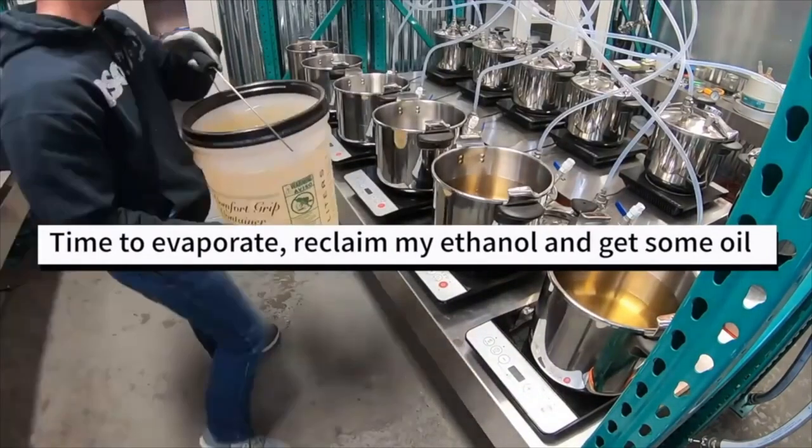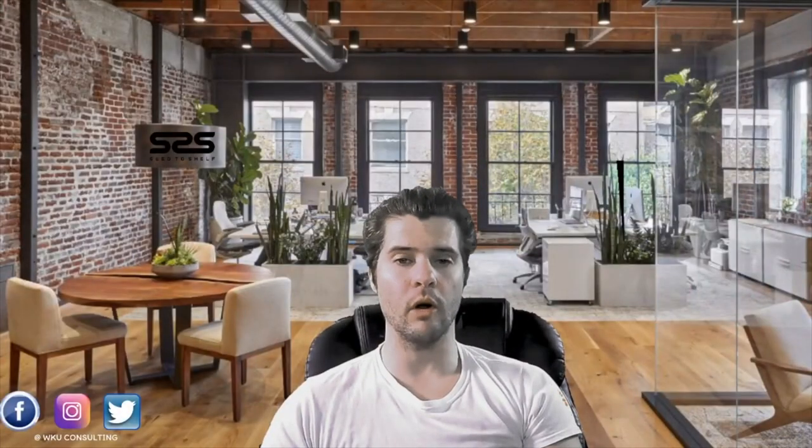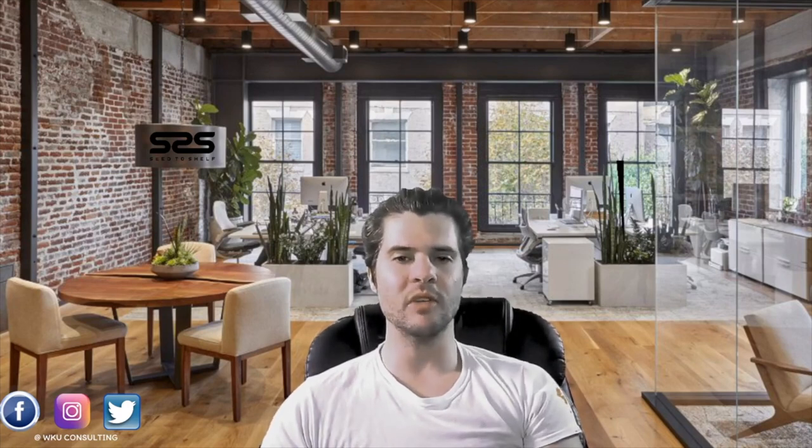Now, what you see here is going to be a manifold. I've got one vacuum pump running an entire manifold. So for everybody out there that cannot afford a rotary evaporator, yes, this is a better way. A rotary evaporator is a better way. But sometimes you can get into 15, 16, 17, even 30 grand for one of those rotary evaporators.